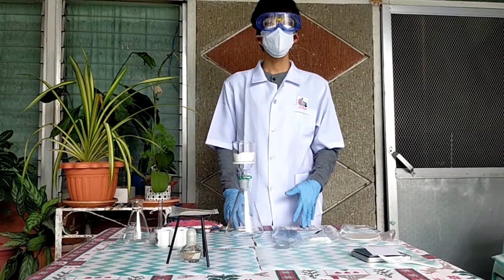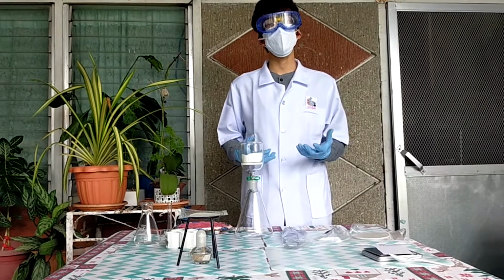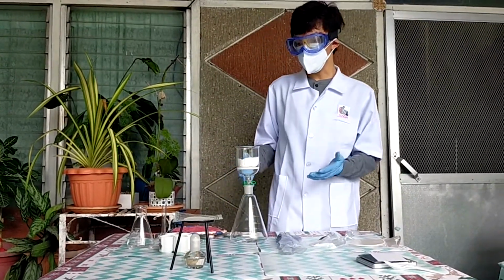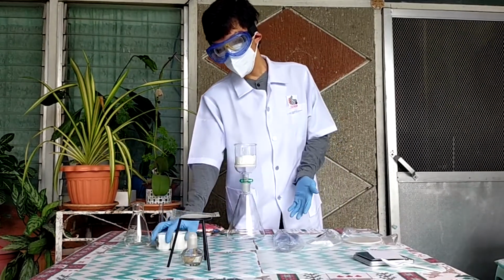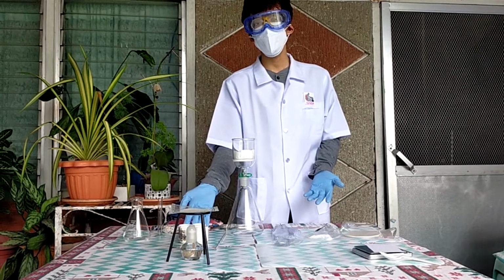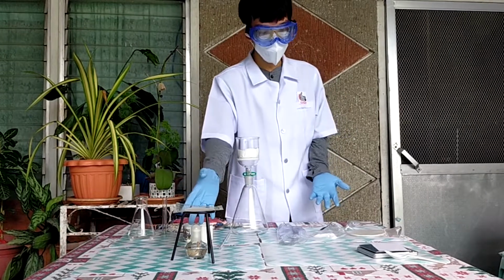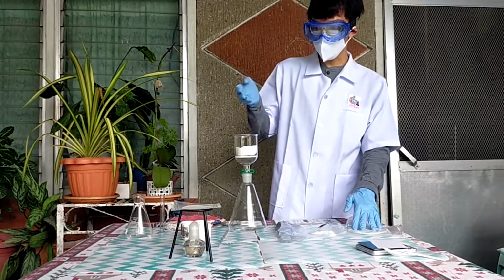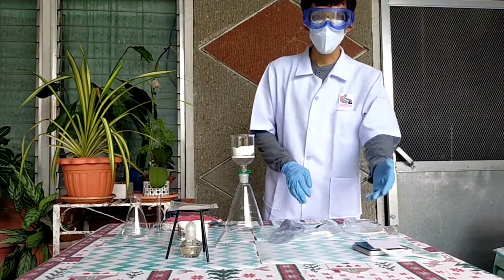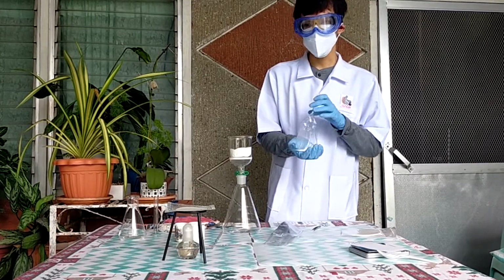Good day. So today we will be performing the recrystallization experiment involving naphthalene. Now, for this experiment, you would need a filtration set, these makeshift test tubes with which we will be testing the solubility of our naphthalene so that we can obtain the best solvent, our heating apparatus, our filter paper which I have conveniently placed here in the Buchner funnel, our charcoal, our weight scale, and our crushed naphthalene.